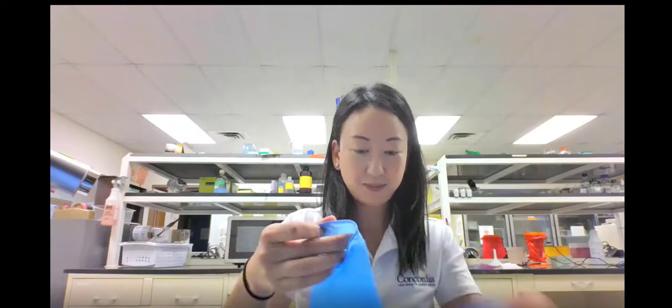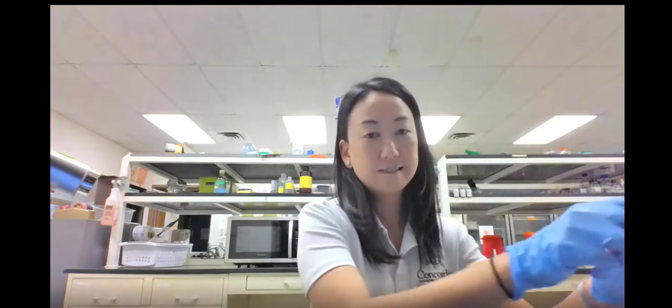Let's start by making sure you have your gloves on. Then you're going to locate the micropipettes on a carousel on your lab bench in front of you. On the carousel, you should find micropipettes of 3 different sizes, but you don't need to grab all 3. Just randomly select one while I'll have all 3 to show you. So hopefully you have grabbed at least one in your hand to take a look right now.